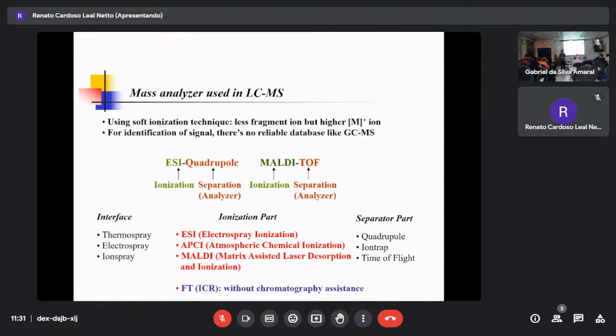And also in MALDI cases, as you mentioned, the quality depends on the matrix. Second, if you are targeting one small molecule, you don't have to use the matrix directly related to the sample position.